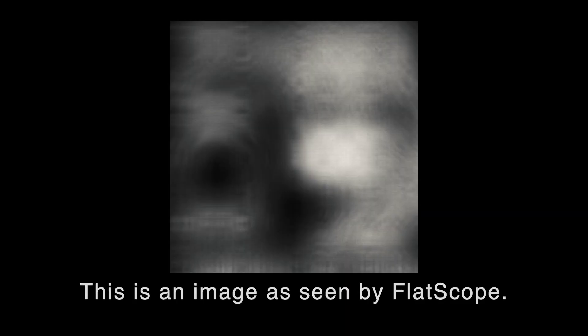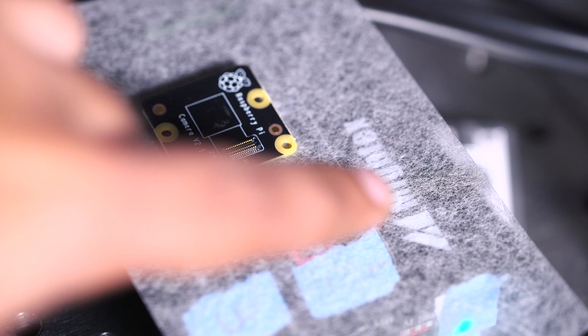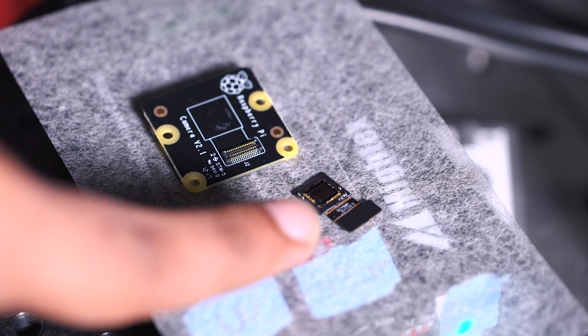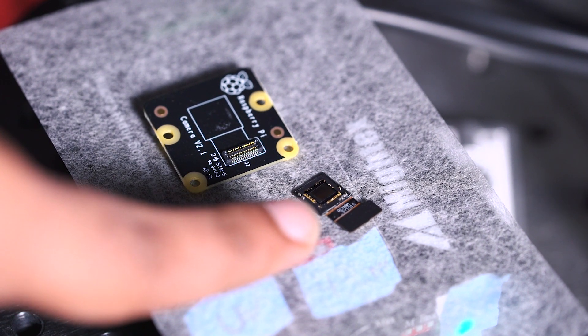We can get a very small form factor down to, in the case of this device, less than 500 microns, which is about five human hairs. So it's very thin, much smaller than the thinness of a credit card.